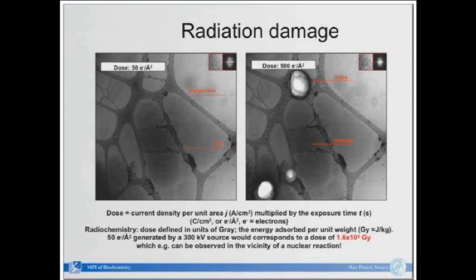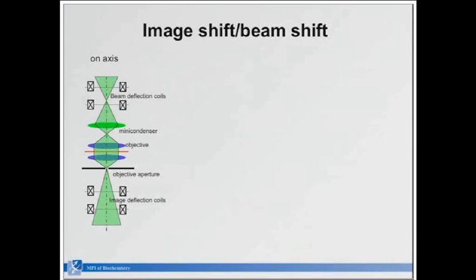I guess it depends on the resolution, how much dose you can spend on your sample, because of the resolution you would like to get in the end on your reconstructed molecule or your reconstructed cell. In tomography, you routinely have a resolution of 4 nanometers, so it's not in the angstrom regime. For single particle, you can get below 10 angstroms when you collect enough particles. When you have higher symmetries, like Hongzhu showed with virus particles, you can go to 3.5, 3.8 angstrom. But that's exactly the same resolution you would like to have for membrane proteins when you crystallize them in 2D arrays.